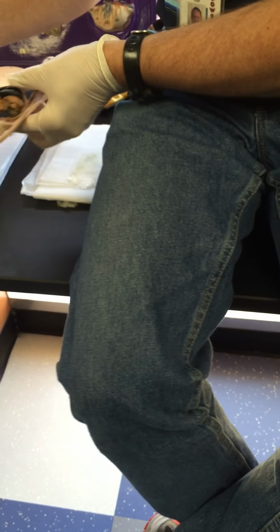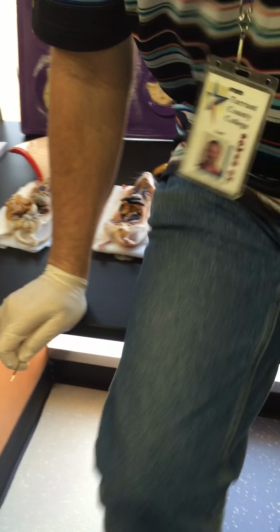In the female cat, it's probably going to be a little bit easier to see. I think there's a female cat over here. There was yesterday. As long as you make sure you get it all. Yep, this one's good.